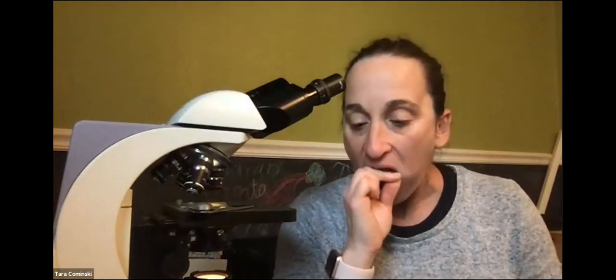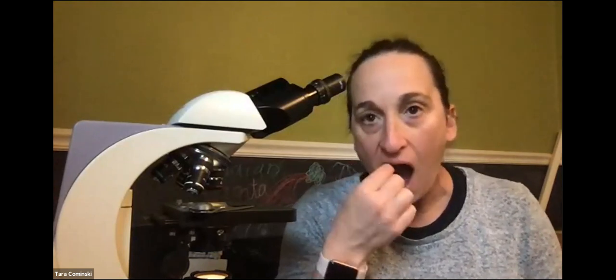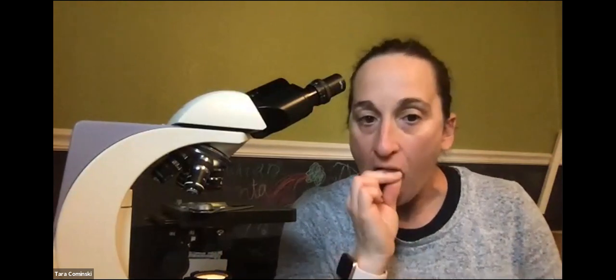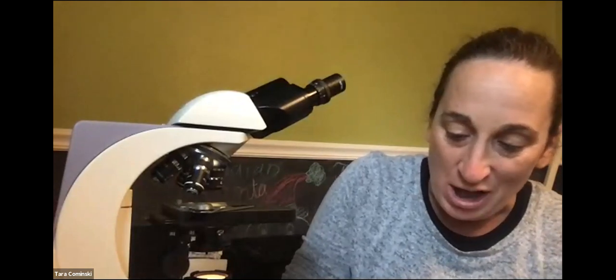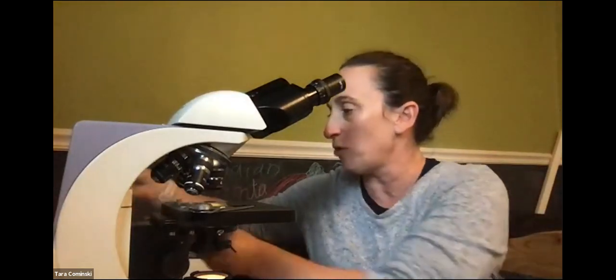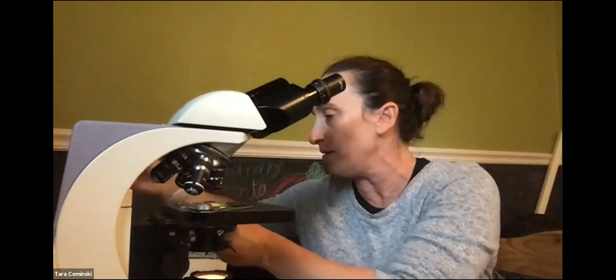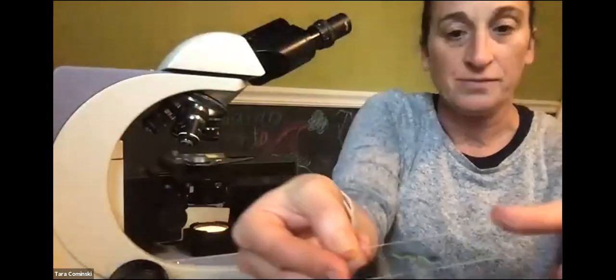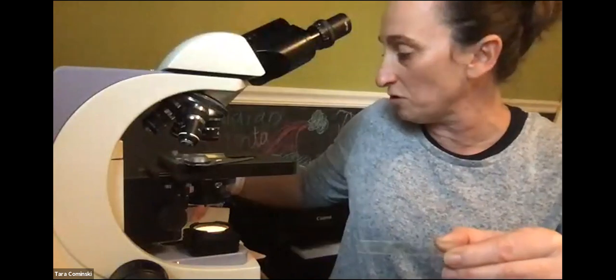So I'm just gonna take a toothpick and I am going to scrape the inside of my cheek, okay? All right, gotta make sure you get in there and you get stuff on there. And so you may have done this before, right? It's possible that you did this in high school or what have you. So I'm gonna put a drop of our bromothymol blue, which isn't really ideal for a stain, but it should work. Okay, so I put a drop on there just like I did with the onion, right? And now I'm gonna put a cover slip on top.